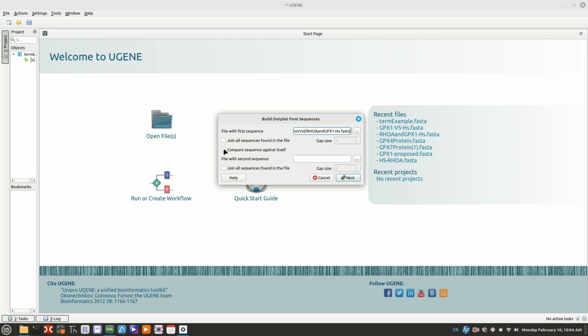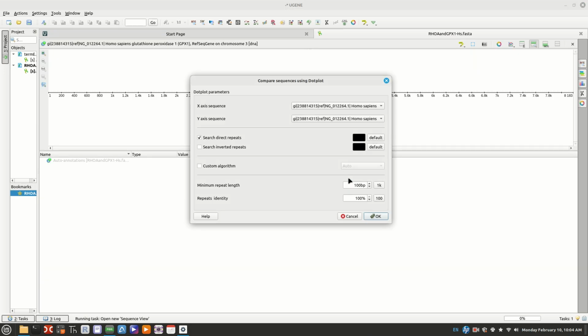We see lots of things with proteins binding to a sequence, but finding a hairpin loop and some folding, that's more interesting, and we needed to see the variety. So I gave you one here that was a hairpin. And hairpin is the more common one. All right, so make sure you click on inverted repeats or this won't work. Compare it against itself, inverted repeats. And we'll just start with the suggested here.